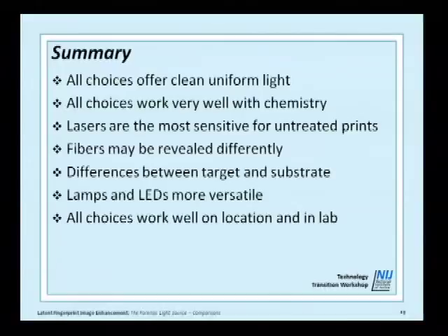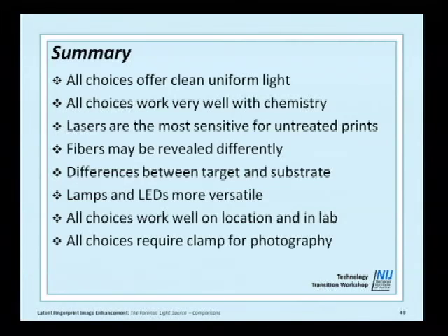Lamps and LEDs are more versatile and lighter. All choices now work pretty well on location and in the lab. And all of the choices require some sort of clamp for photography. You need something, a Bogan clamp, or if your light source has a tripod mount or something of that nature.